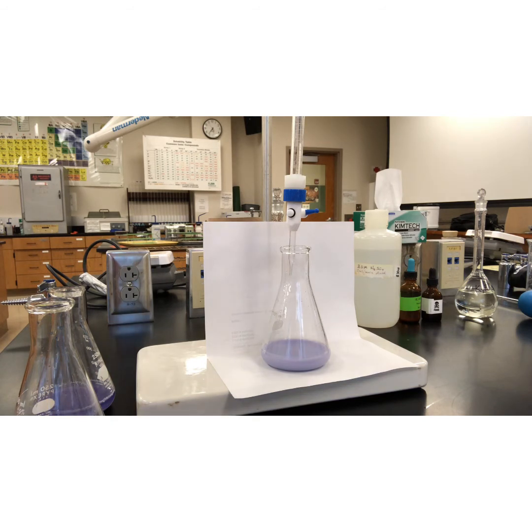Check my delta V. And let's go at 1.8. 18.58. Boom, that was a good one. 18.58. So my delta V's were 18.71 milliliters, 18.54 milliliters, and 18.58 milliliters. Boom, we're gonna call that good on those titrations.